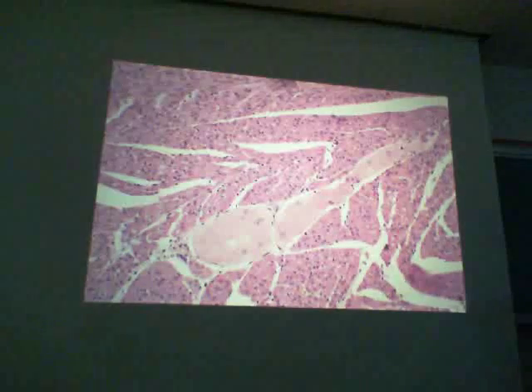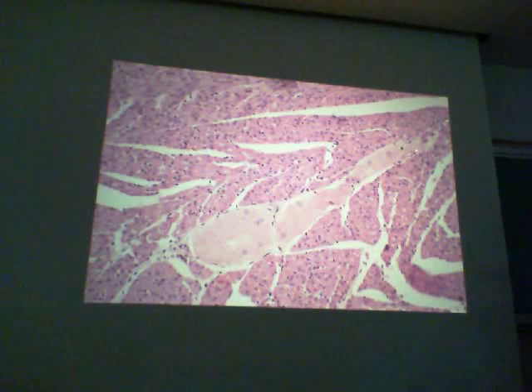Okay, this tissue, what is this? Cardiac muscle again, right. Okay, and here are some more Purkinje fibers right here. In fact, this is the one that was up on demonstration. Okay, and how about this tissue? What is this? Cardiac muscle again.